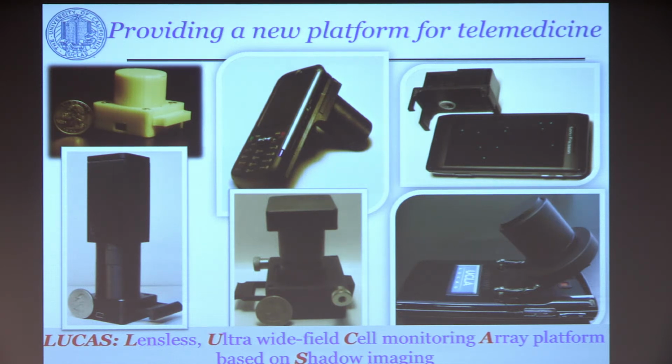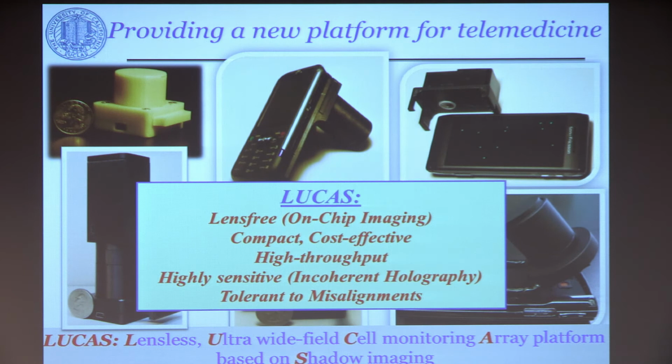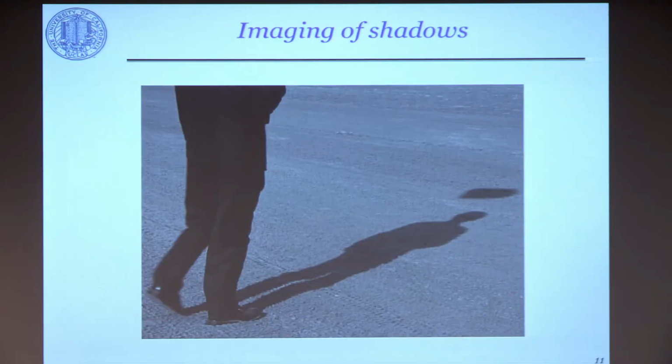So we don't have that sophistication that you find in a normal microscope. However, we have algorithms to make up for that. These designs are lens-free. That's why they're very compact and cost-effective. We've got rid of a lot of these expensive alignment-requiring designs and replaced them with essentially computational algorithms to bring you an interface that is high throughput, that has high resolution, that has high sensitivity to the level where it can literally see individual viruses, as I've said, in a field-portable way.